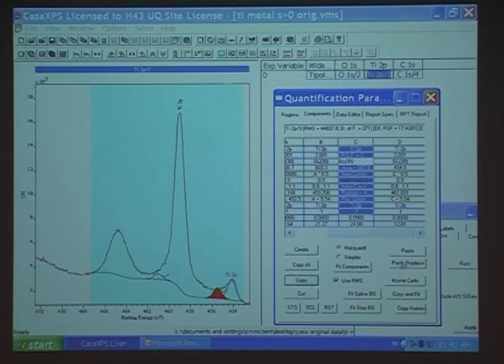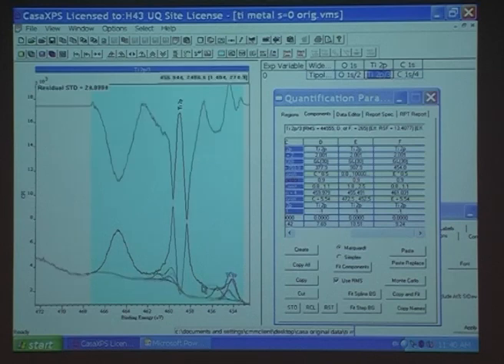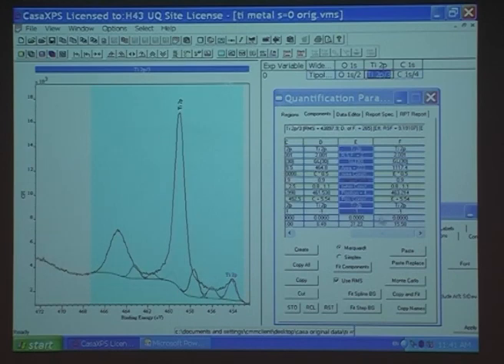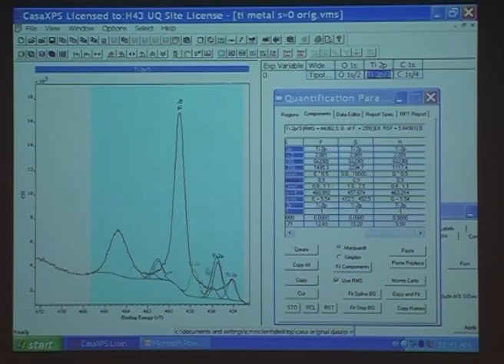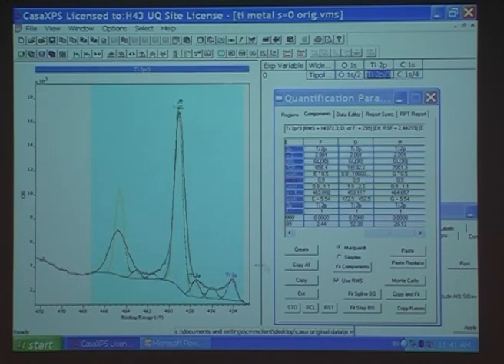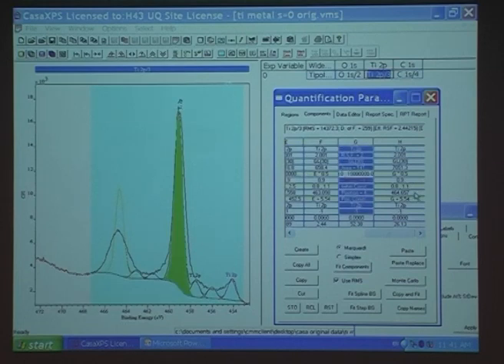Copy and paste. Bring this one to the side. Bring another one in here. Bring this one back. I'm trying to get a bit of a fit myself. Then I'm going to go copy and paste. Bring this one here, this one up into here. Now I'm getting somewhere. This one down into here. And I'll go fit. No, it still doesn't want to do it for some reason. What? E times G times 0.5. I've got to make this width.